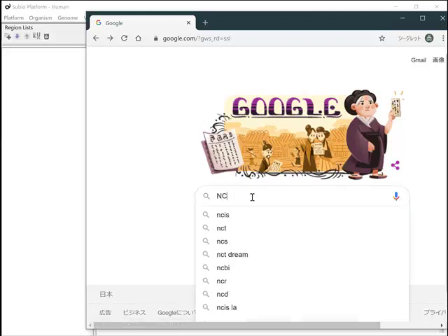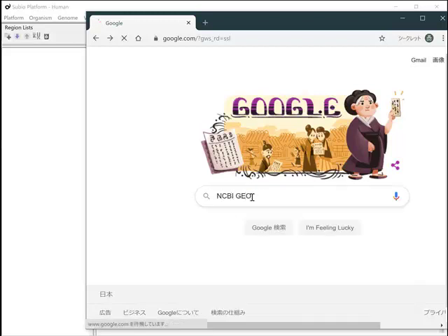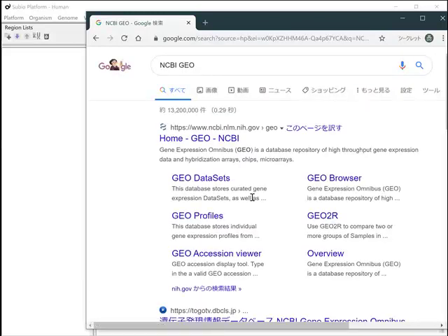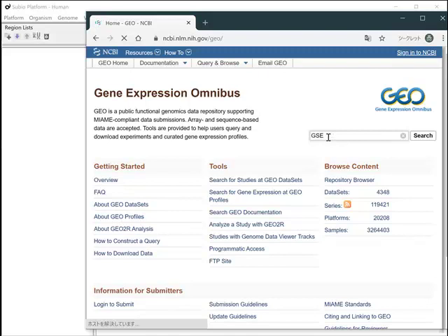Open the NCBI GEO website and search for the GSE49110 record in the GEO database.